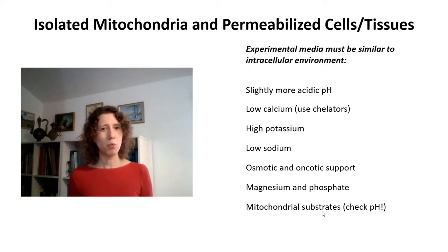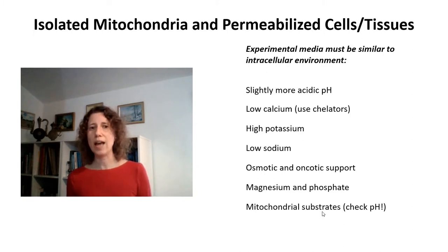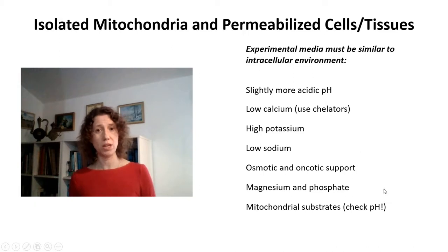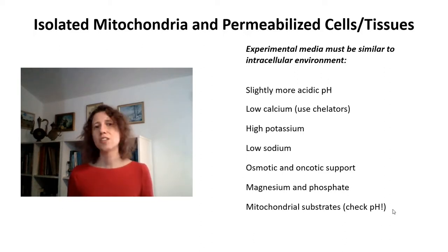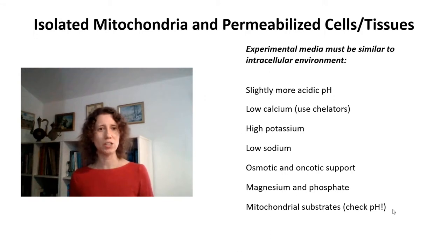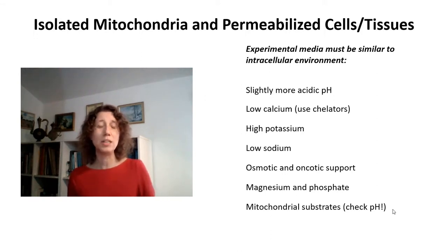An important point is that mitochondrial substrates are typically quite acidic, so make sure to check and buffer their pH — preferably with potassium — before adding them to mitochondria. A common problem is that people add pyruvate without buffering pH, effectively dropping the experimental media pH to around 3, after which mitochondria no longer function.